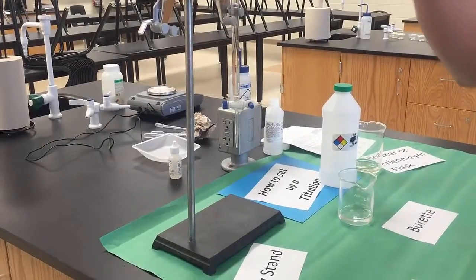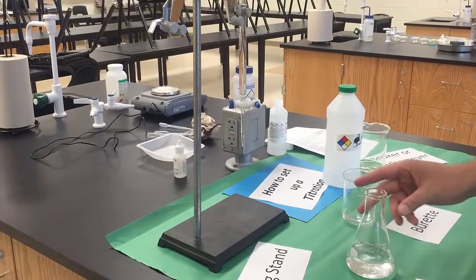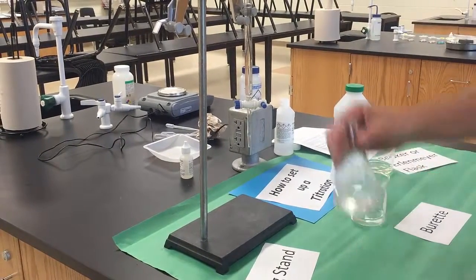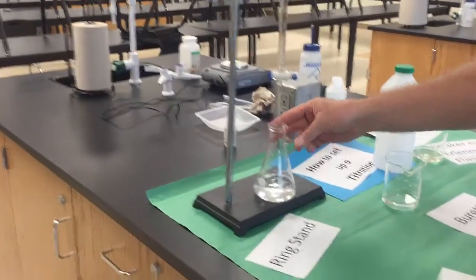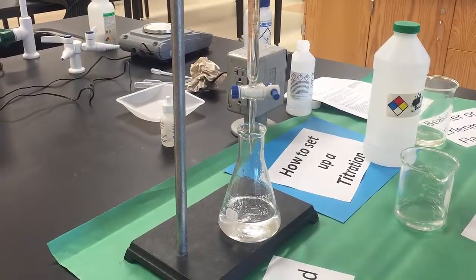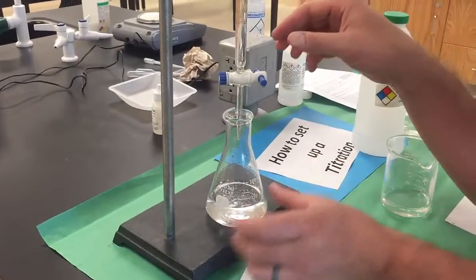Now we're going to titrate our KHP sample with the sodium hydroxide we've just prepared in our burette. Remember, we started at 2.4 milliliters, so we're going to decide how much sodium hydroxide it's going to take to neutralize this KHP. So if I put the KHP solution underneath and I drop the burette tip so it's below the mouth of the flask, this is the part where we're actually going to do some titrating.